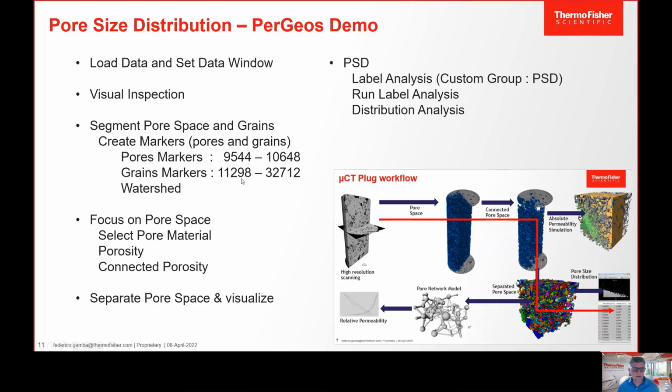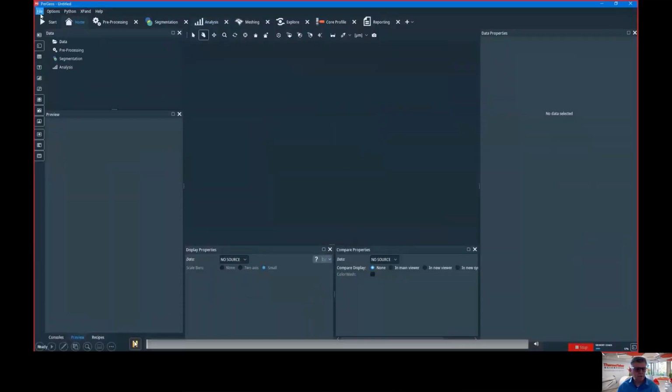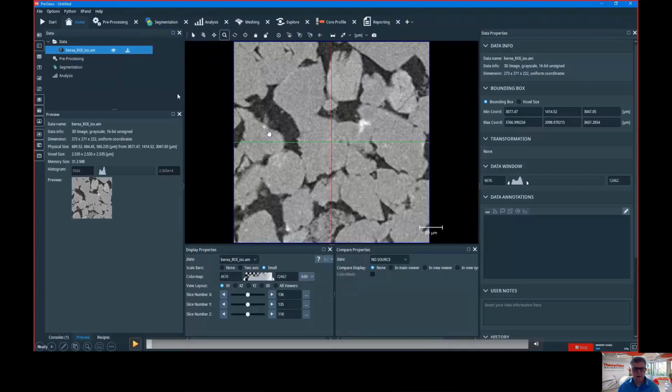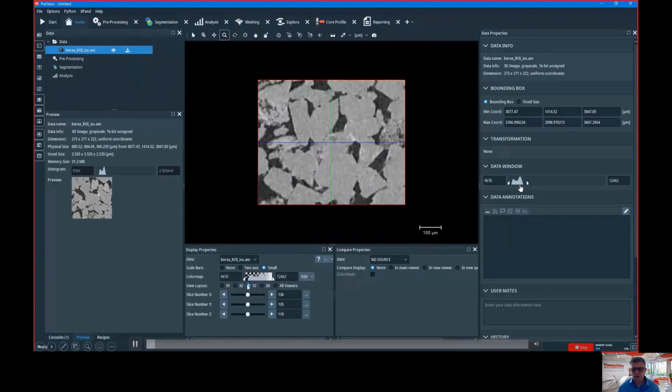So let's start, because I think I'm a little bit behind. I start the video. Of course, at the beginning, you load the data, and you immediately get the data visualized. You have nothing to do, and with the right contrast. You don't have to specify anything. If you want, you can trim the contrast here.